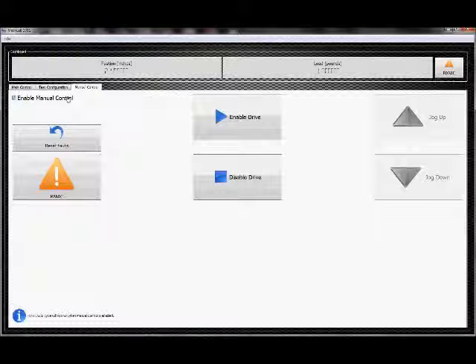Manual control is mainly for servicing the system. You can enable manual control, enable the drive and jog it up and down. There's no practical use for this in terms of testing, but if you feel the need to service or test out the mechanical system, it may come in handy, and certainly it's a good startup test. Most people won't ever need to use this tab. You may be asked to use it by an ADC technical support representative.